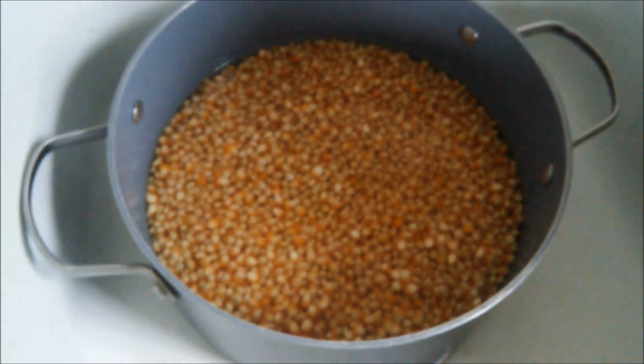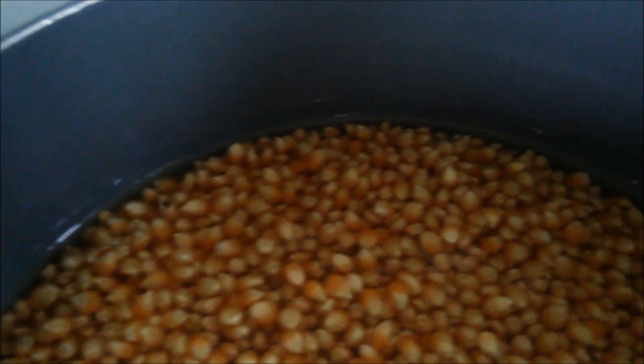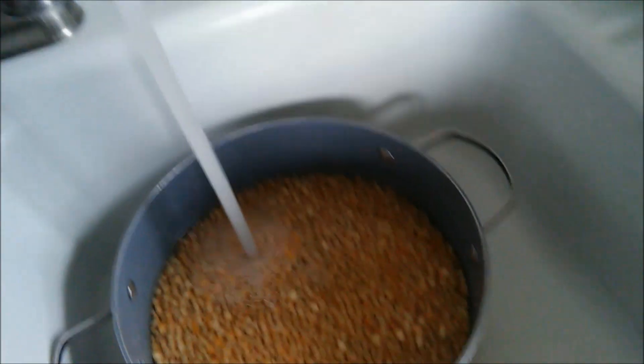The corn has soaked overnight, approximately eight hours. And as you can see, it has absorbed about a half inch of water. So what we're going to do is just add a little bit more water here.